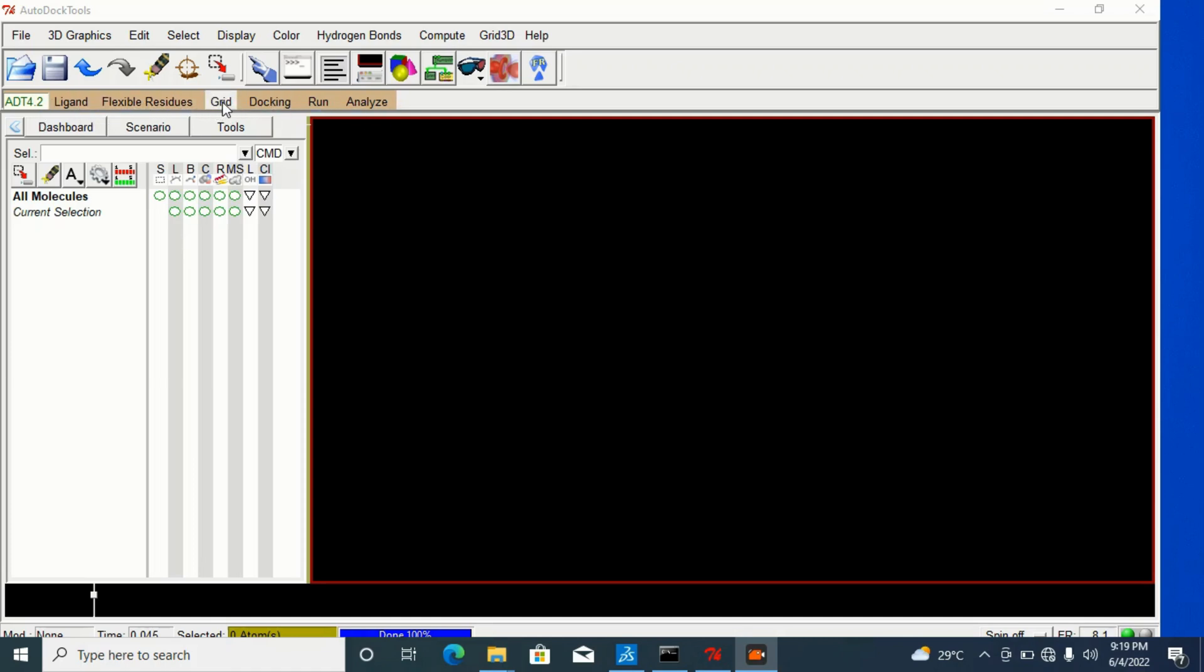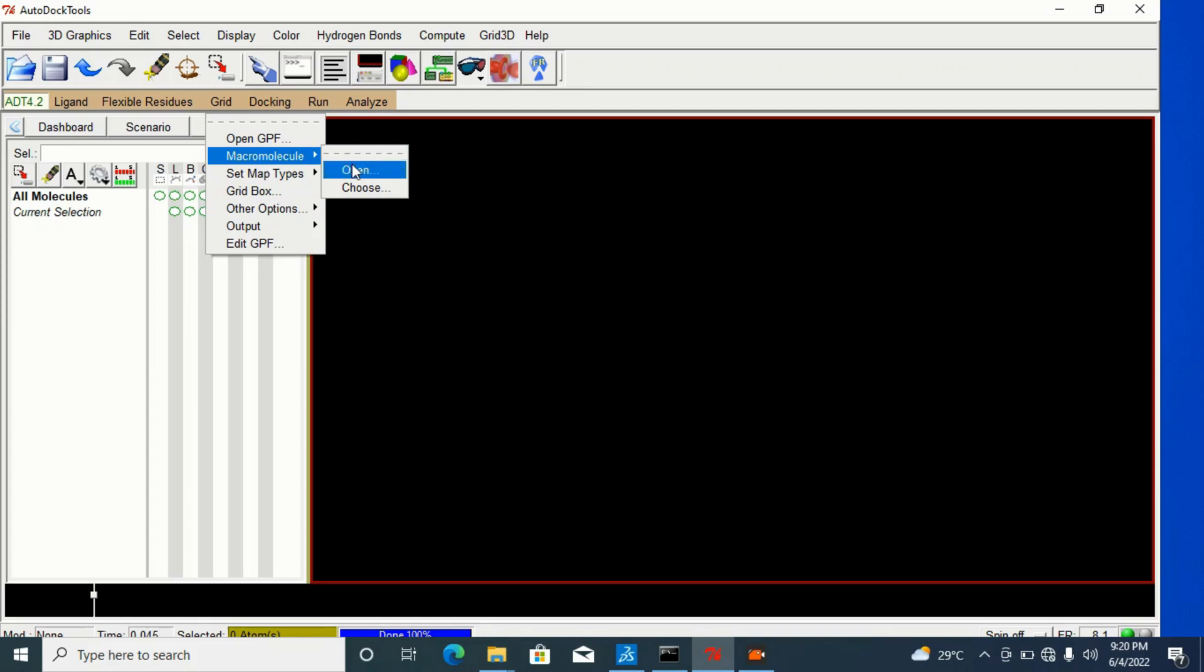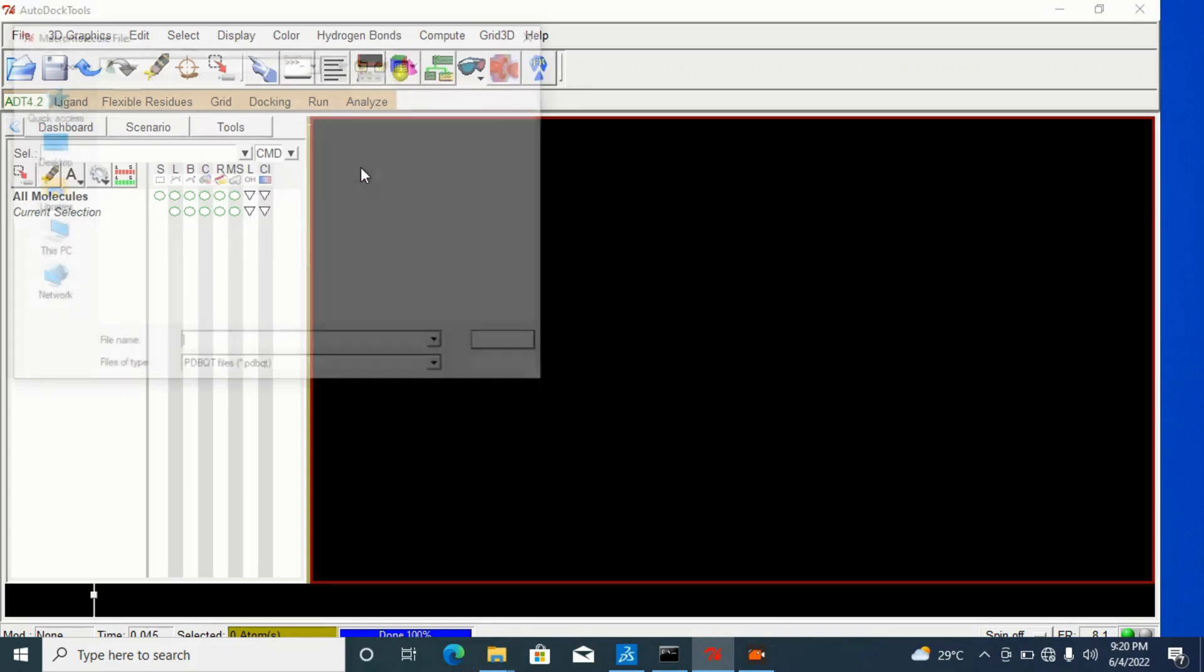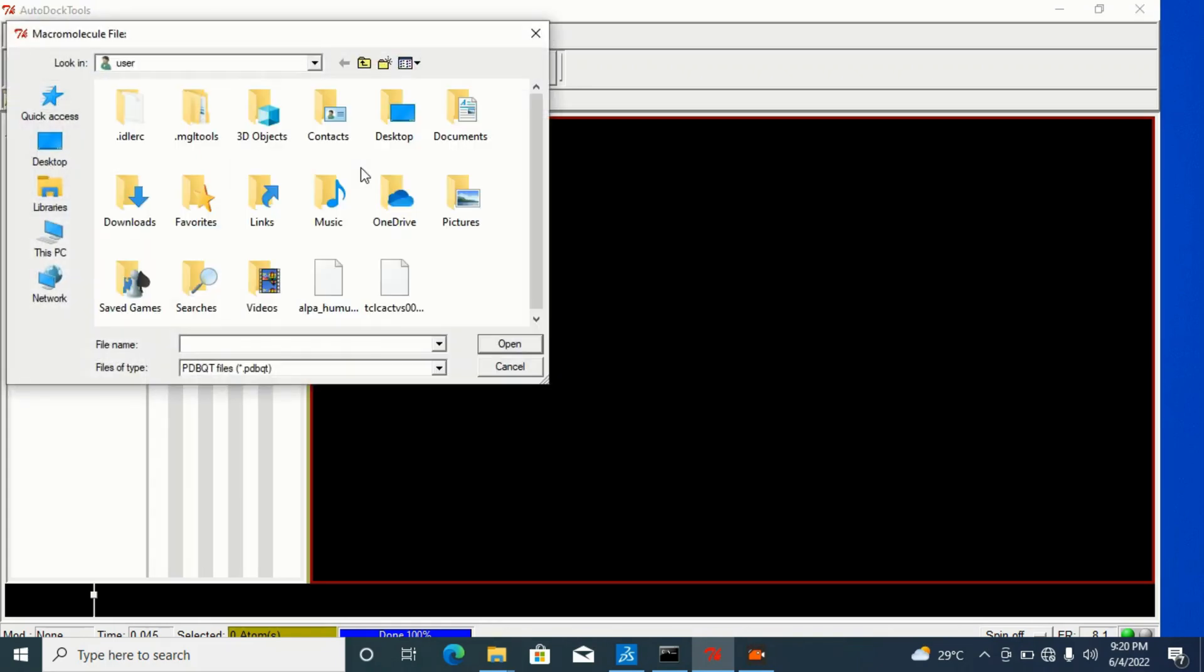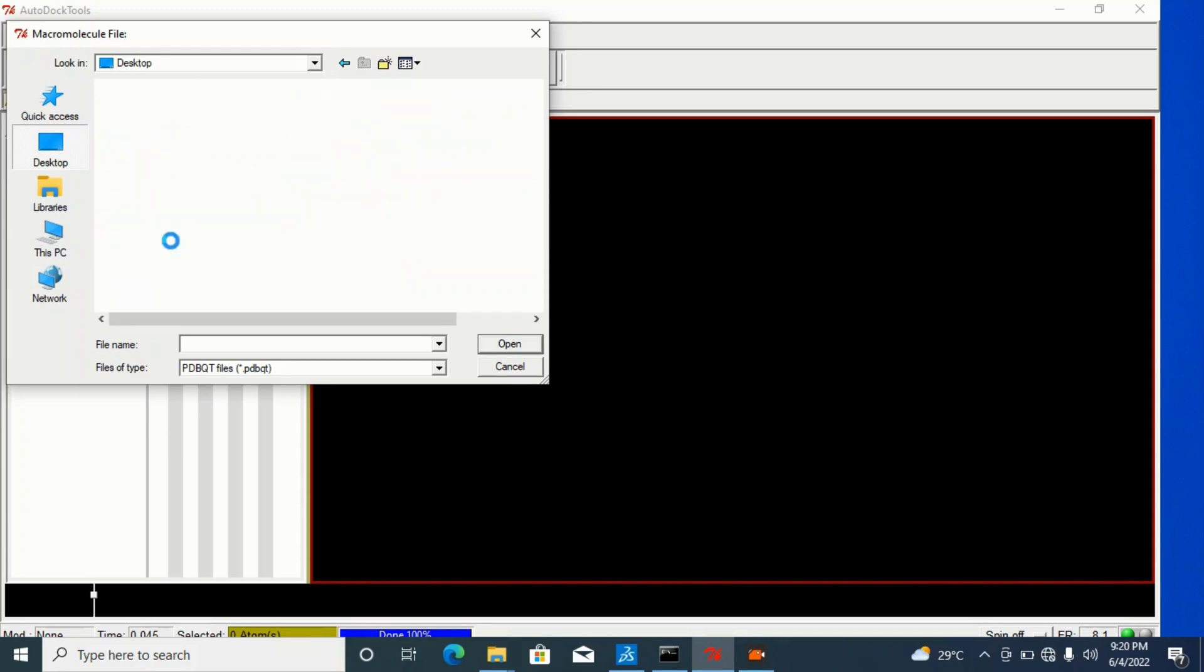Simply click on grid. It will ask you to open this. No, we will go to our macro molecule and now open it. If you open it, it is where it takes you to, but mine is on my desktop. So, I will go to my desktop, my docking tutorial.